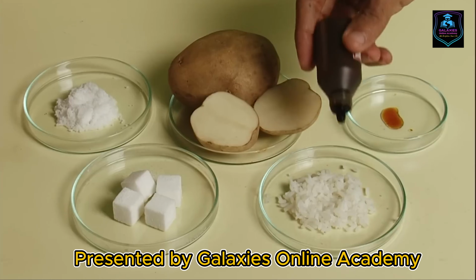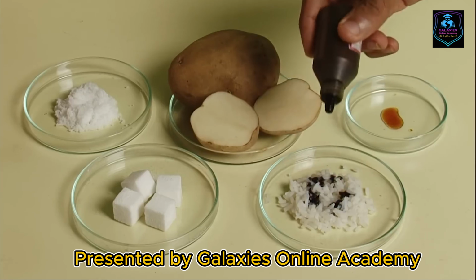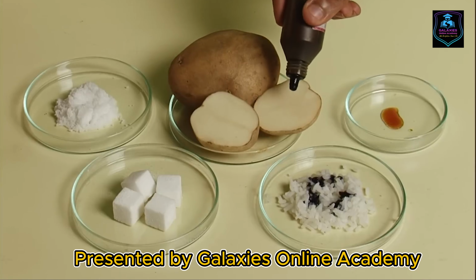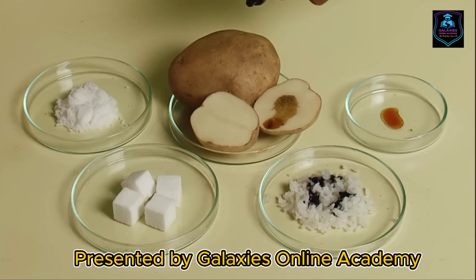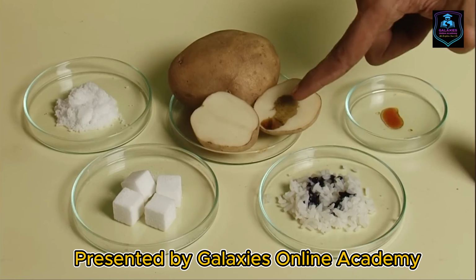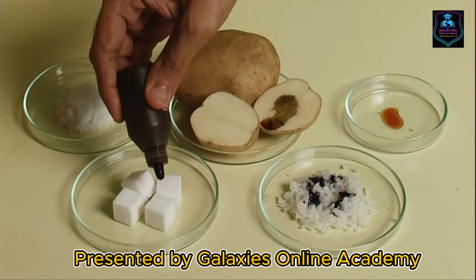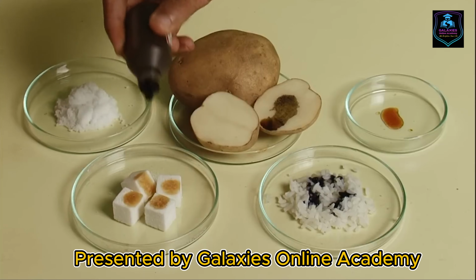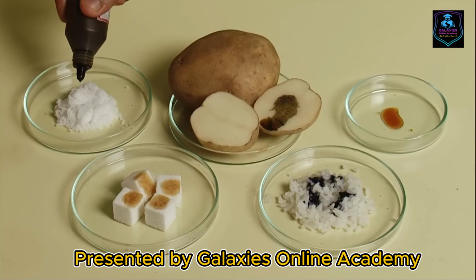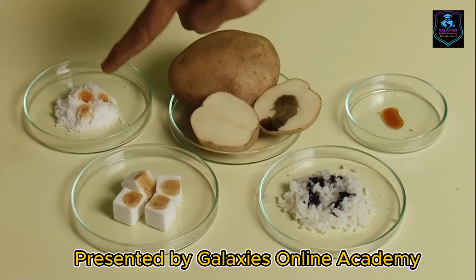Now I will put some drops of iodine solution onto the rice, potato. Right now, look at the color change. You can see the iodine solution changes into a purplish blue color. Also look, I will put some drops onto the sugar cubes and also the salt powder. But they do not change the color.